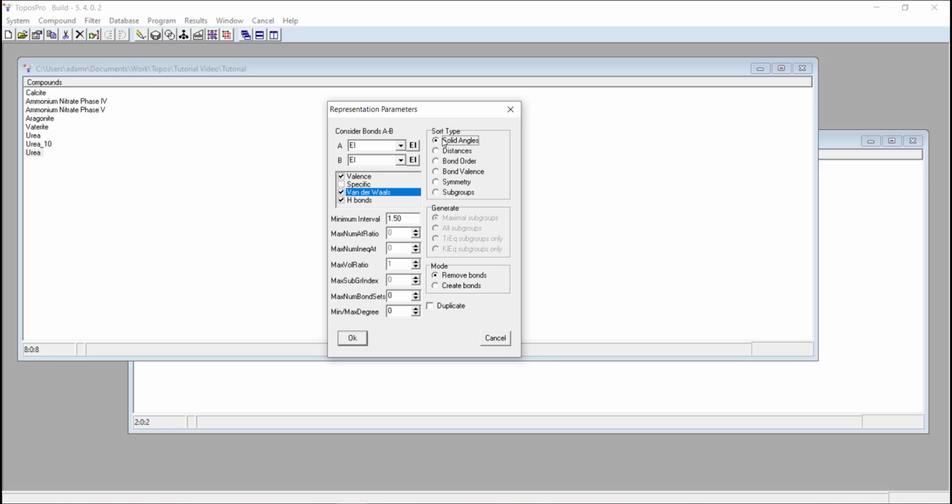It's not exactly the same as the domains method, but they are very close to each other. So as long as you check your files to make sure that they make sense, this method can help you generate a series of structure files with reducing interaction strengths considered. So it can be quite useful to use this approach when you're not sure exactly which interactions to consider.